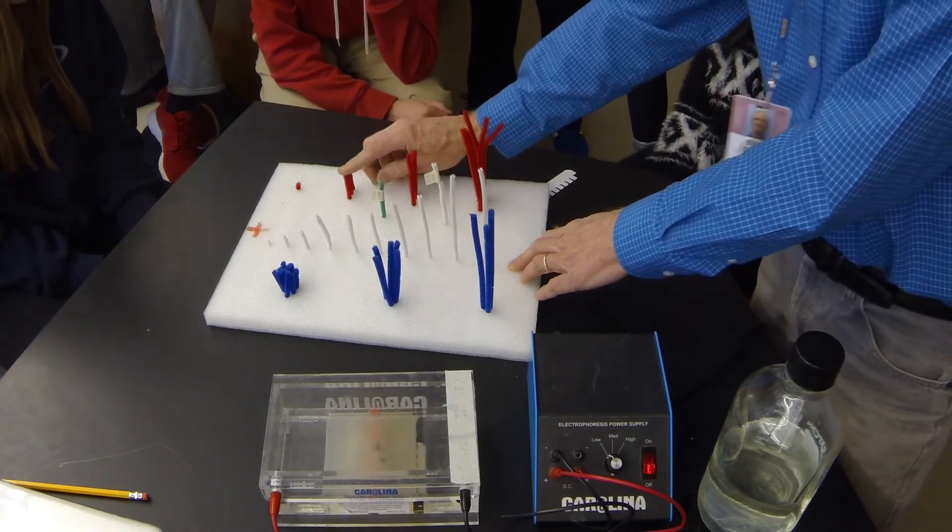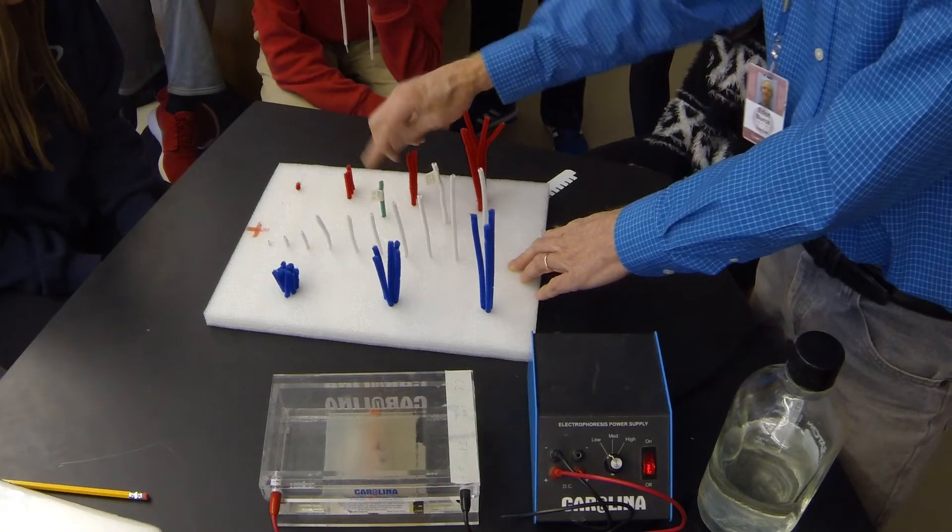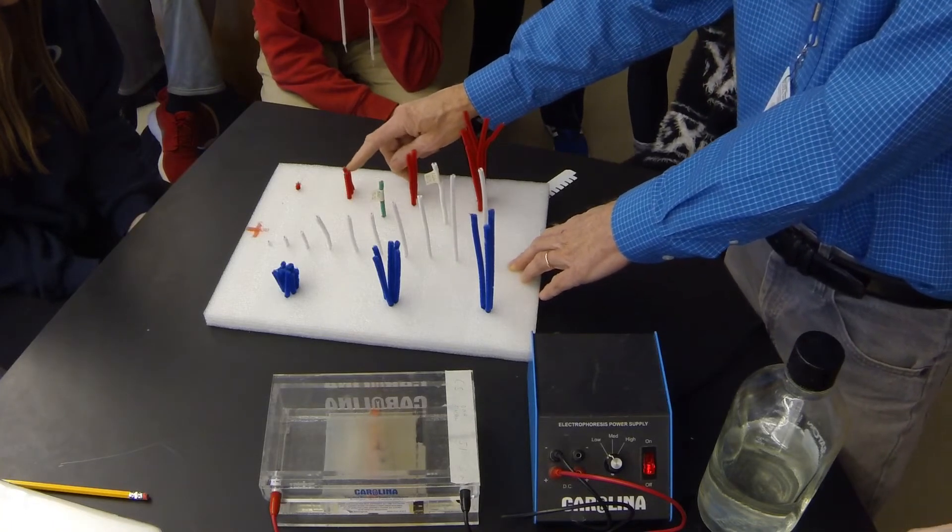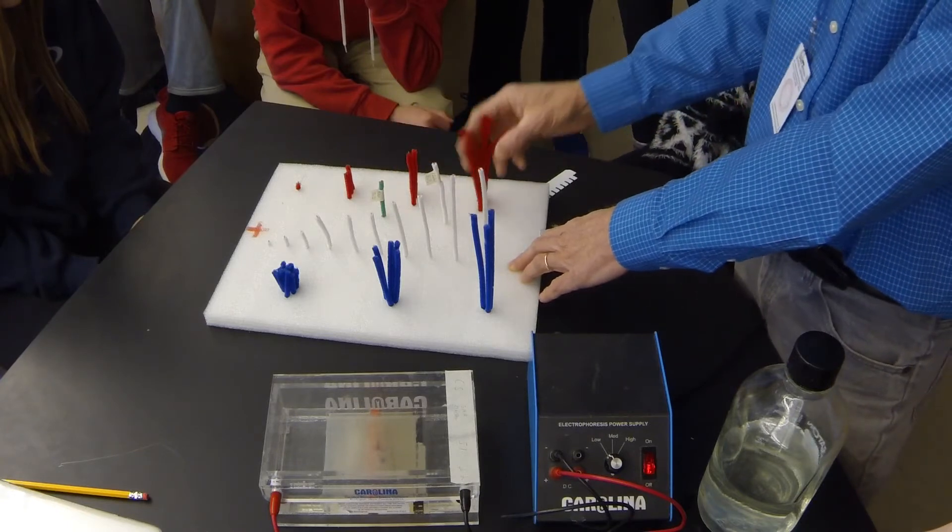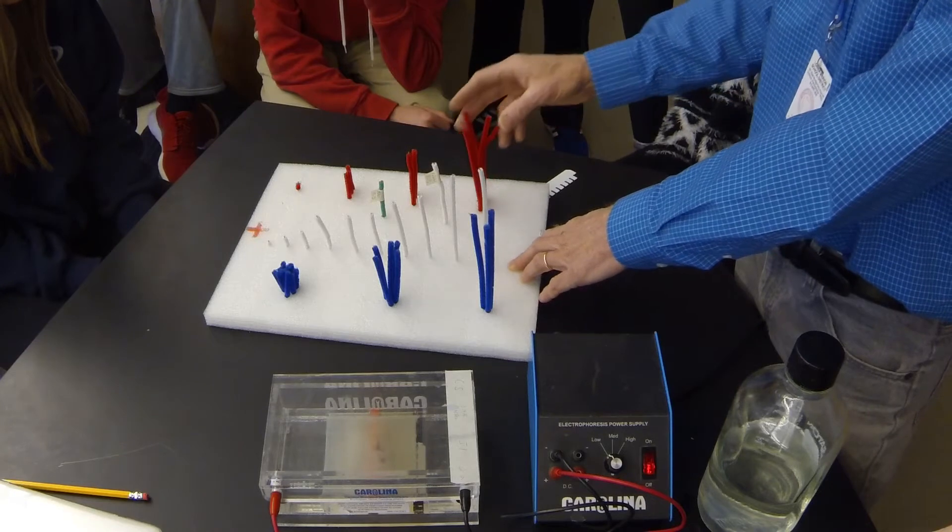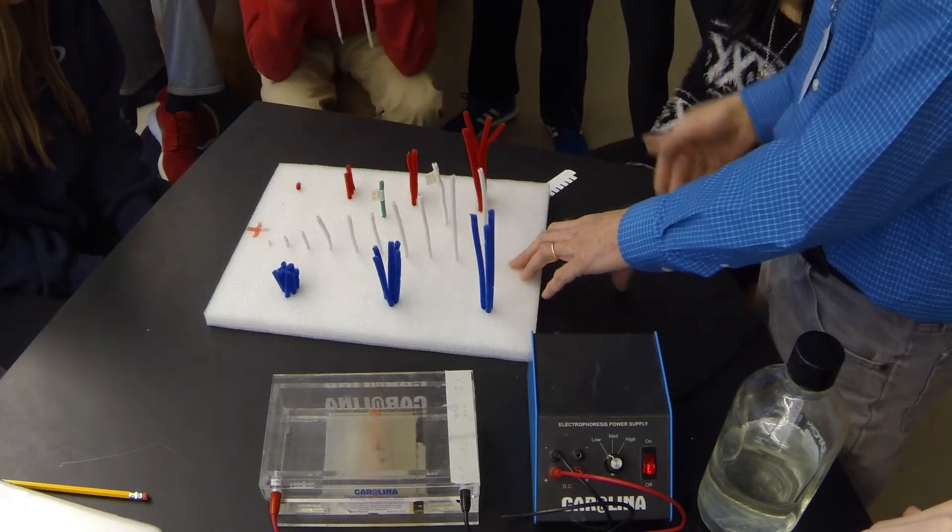These went further than the 800, and based on how much further, you could conclude that these maybe have a size of about 600, whereas these didn't go as far as the 1200, so maybe they're like 1400. So those three things help determine your DNA fingerprint.